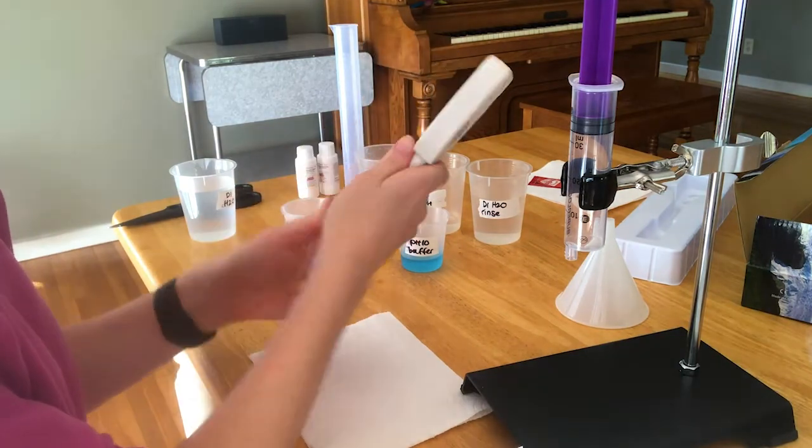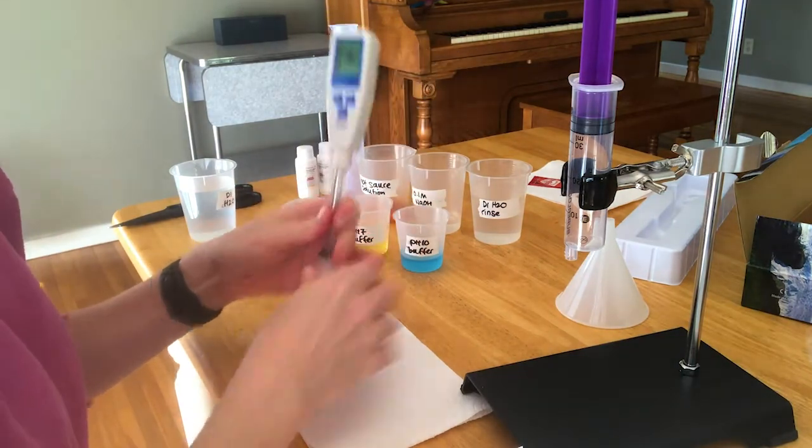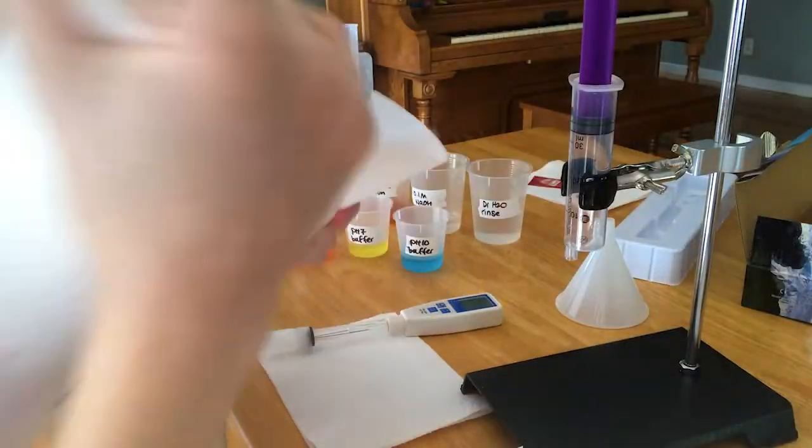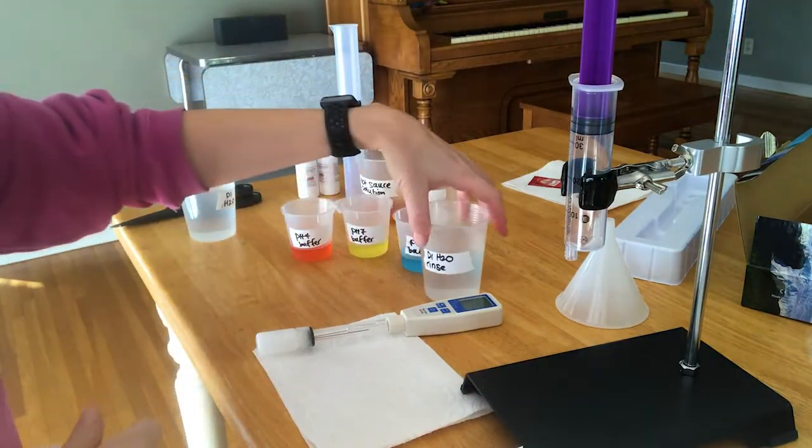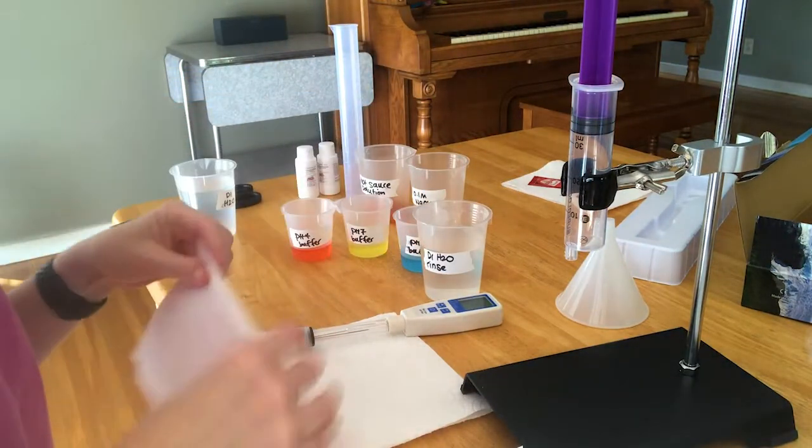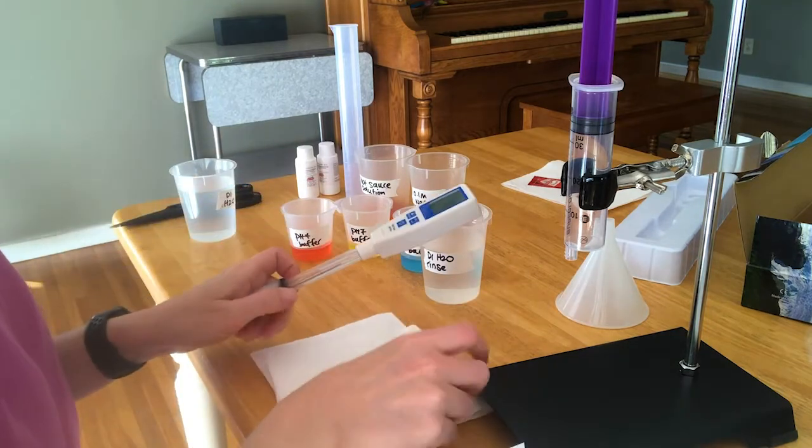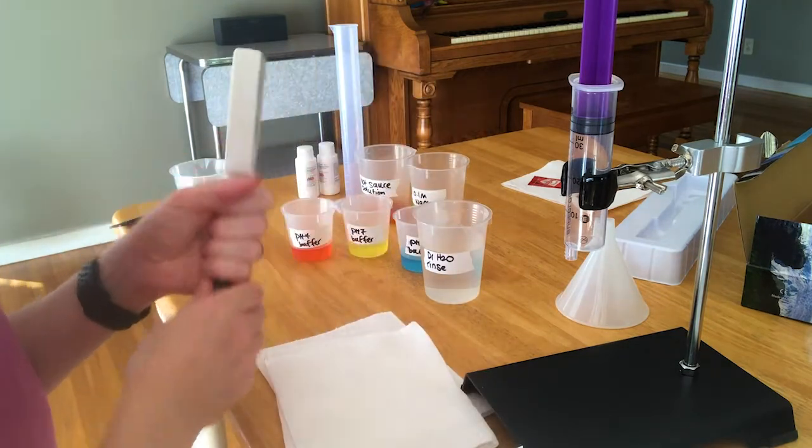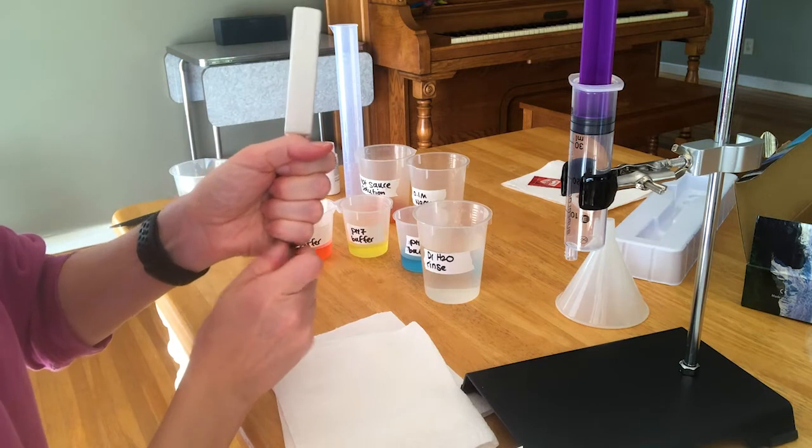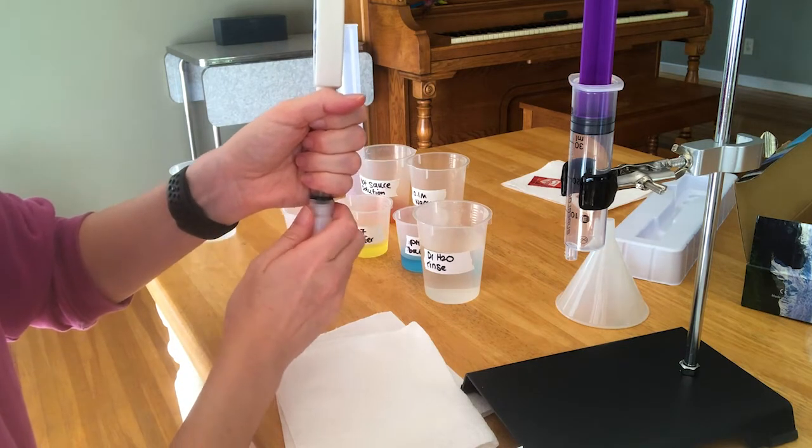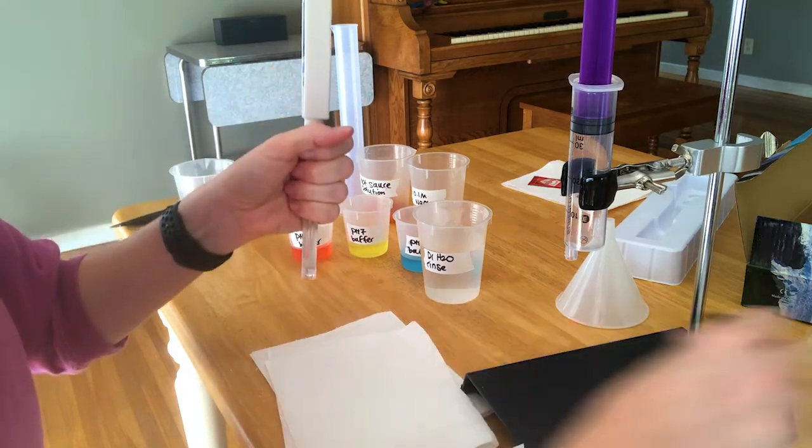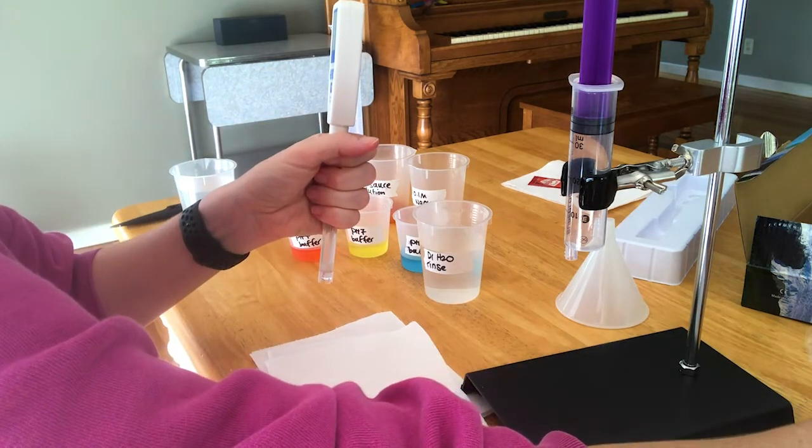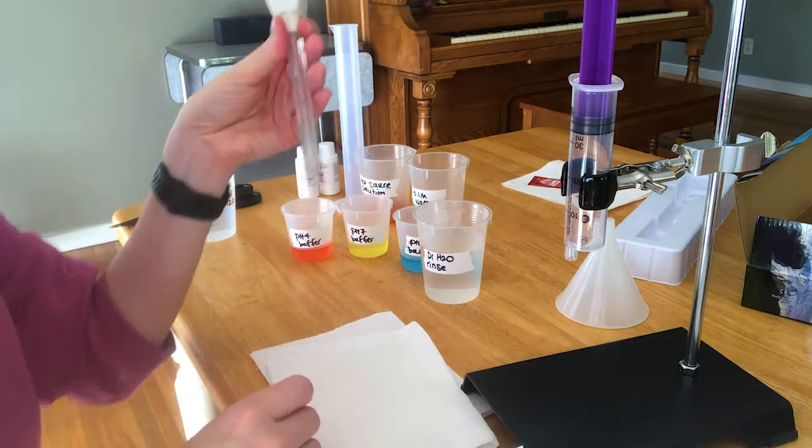We want to be able to rinse this pH meter off with distilled water after every single solution. But we don't have a wash bottle, so I'm improvising. I put some DI water into this beaker. You want to put kind of a lot so that it's dilute. This isn't ideal because you don't want to contaminate the pH meter. Since this glass electrode is sensitive to ions, you do want to use distilled water and not tap water.